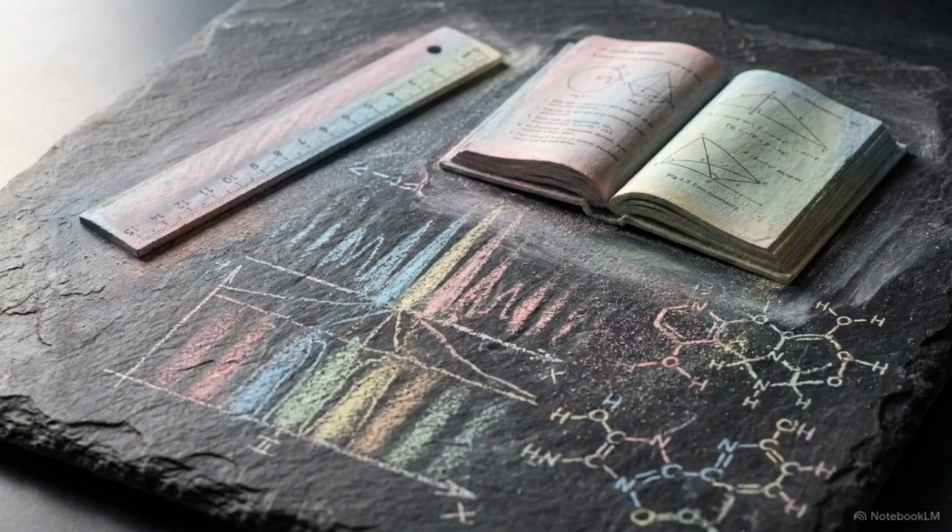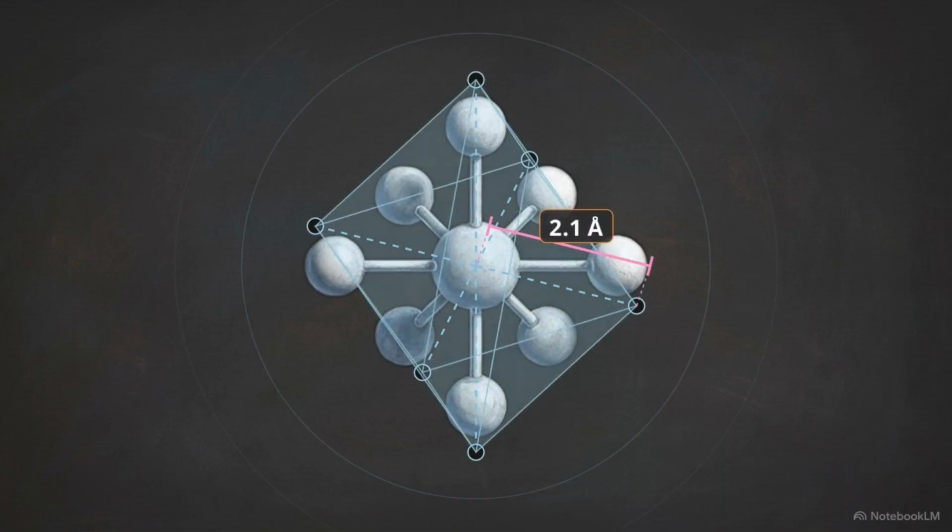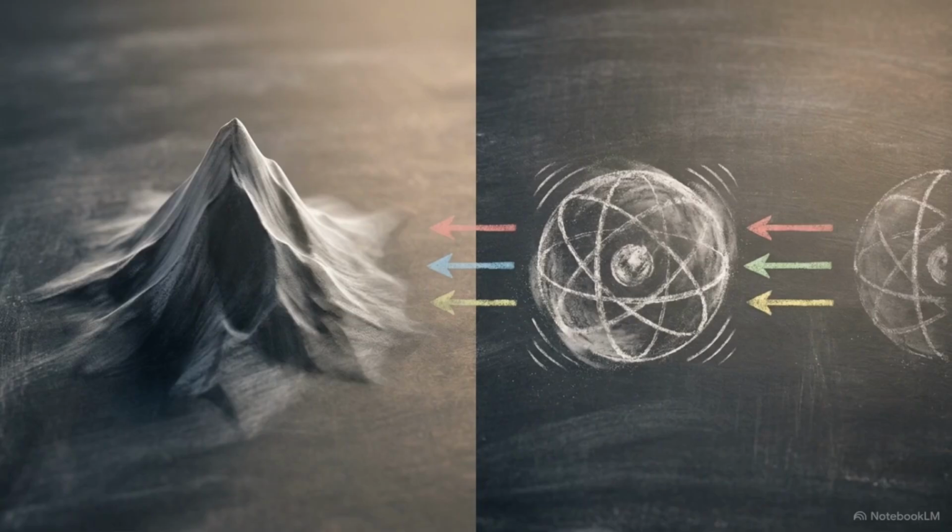Separating dynamic motion from physical absence requires data outside the math. Structural biologists must apply chemical constraints, like expected bond distances and coordination geometry, to differentiate a shaking atom from a missing one. The mathematical reconstruction process is entirely blind to chemistry. The map alone cannot distinguish thermal vibration from a vacancy in the lattice.